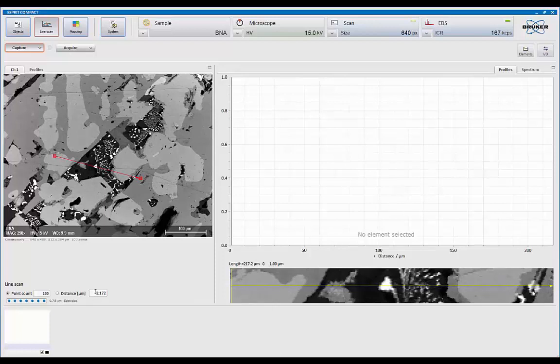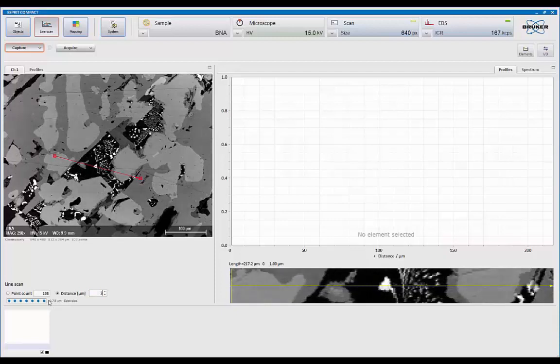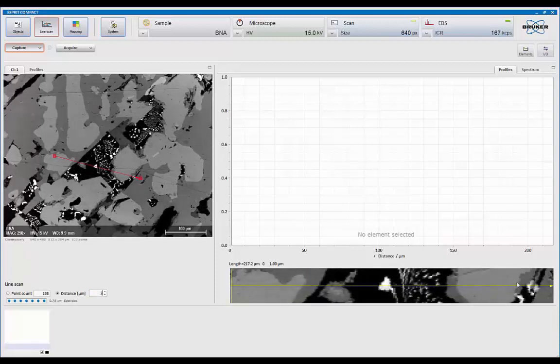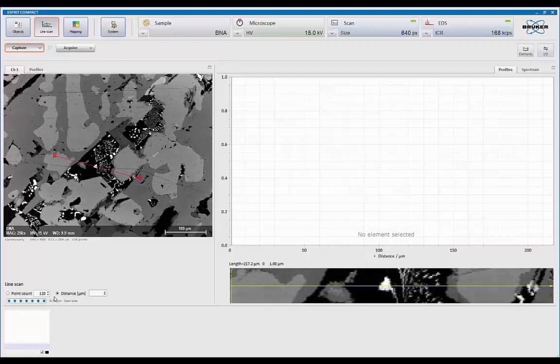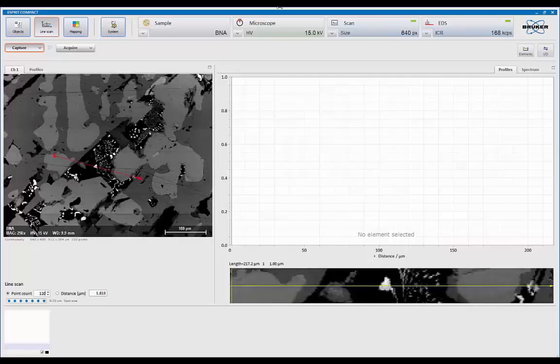So earlier we saw that from our quant results, my x-ray spatial range was about 2 microns. So I can set this, and the system says then you need 108 sampling points to do it end-to-end. In this case, I'm going to actually up that to 120, so I have a little overlap between them. So it's going to be about 1.8 microns. So there's a little bit of overlap going on in there. So I'm satisfied with that.